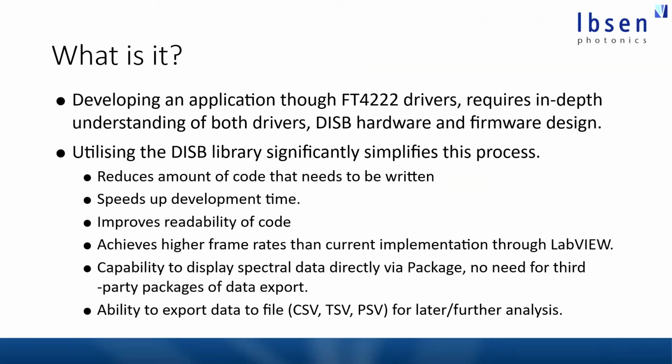As mentioned, they are developed based on the FT4222 drivers, and they do not require an in-depth understanding to use this software. It basically helps the end user by reducing the amount of code that needs to be written to actually get the application working that they want to have. This helps speed up the development time, and it also improves the code readability overall, as all functions that can be used in these applications from the Ibsen library have names that reference what exactly is being done with the spectrometer.